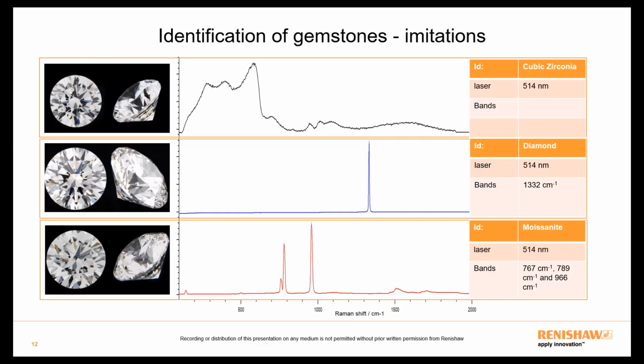The diamond spectrum characteristically has a single main Raman band due to the presence of only carbon atoms and its highly symmetrical nature. This means that all the molecular vibrations are effectively equivalent within that material.